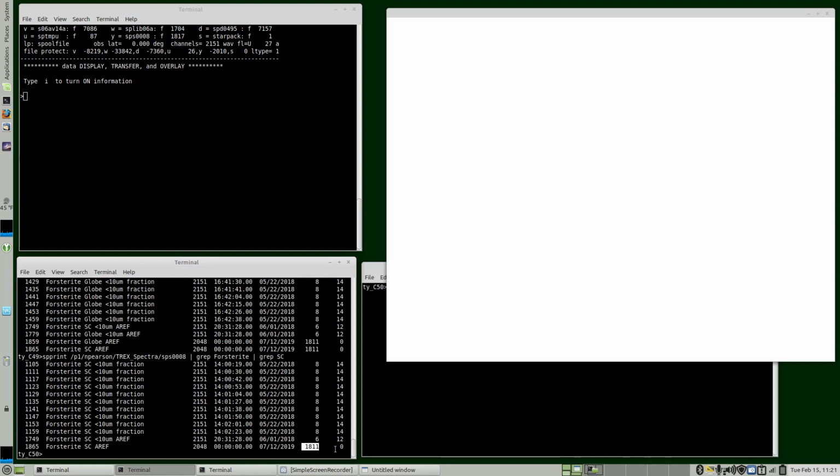The wavelengths, and we have no pointer to the resolution for the ocean optics data. We'll need to synthesize that, or if you have that measured from your spectrometer and have it in another place, you need to go find it and add it. But it's not here, and I've searched through this file and it doesn't exist in this file that I found anyway. So we need 6.